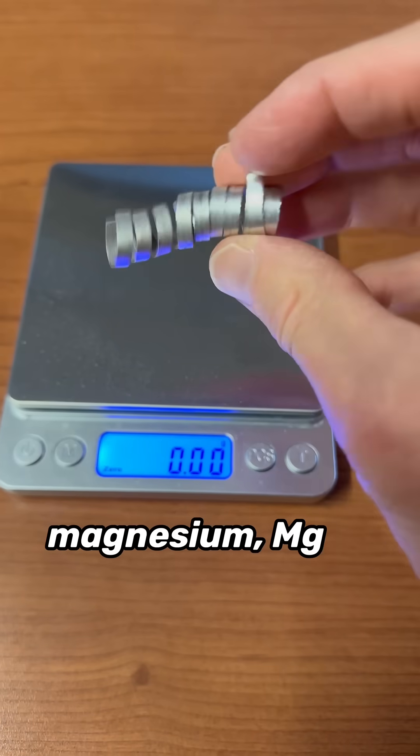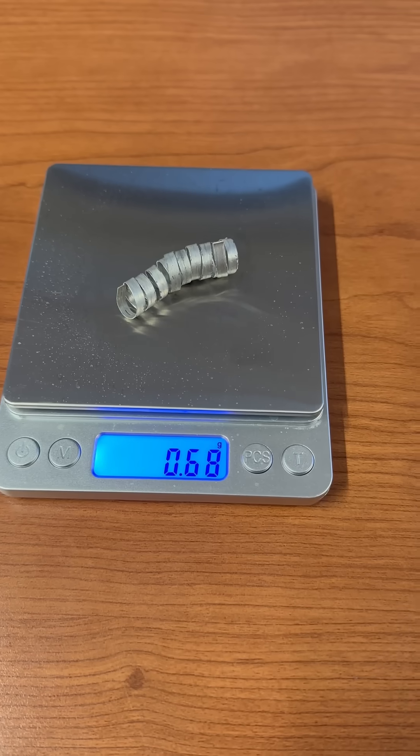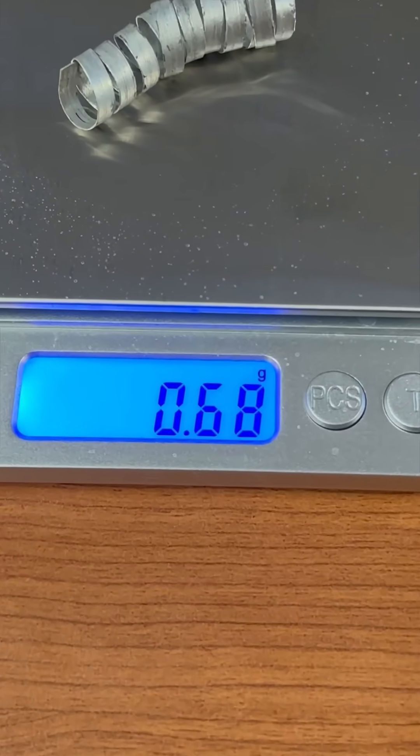First, let's find the mass of the strip of magnesium we're going to use. We can see that it has a mass of 0.68 grams.